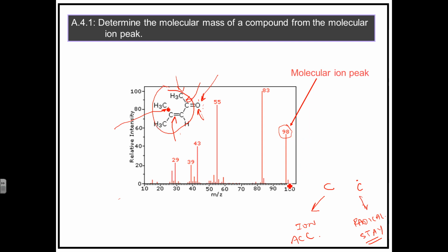The little peak here to the right of that, they're called shadow peaks, and they're usually due to isotopes of hydrogen or isotopes of carbon present in the organic molecule, and they're usually 1 or 2 atomic mass units either side of that molecular ion peak. So really we're just looking at the biggest peak furthest to the right in the graph. That's called the molecular ion peak.